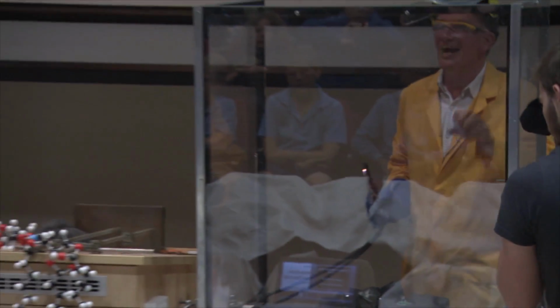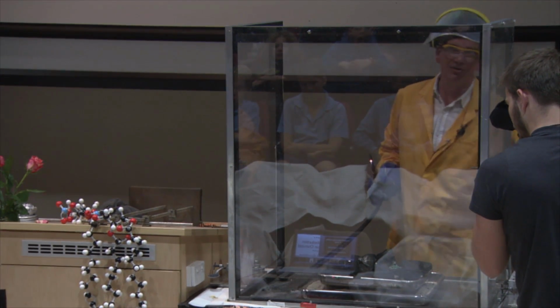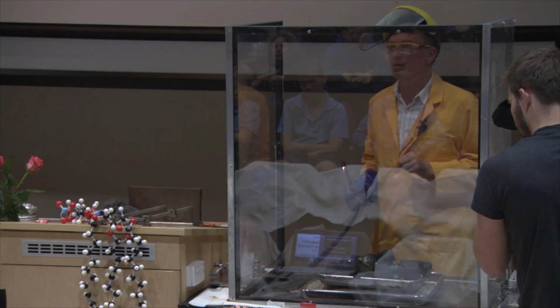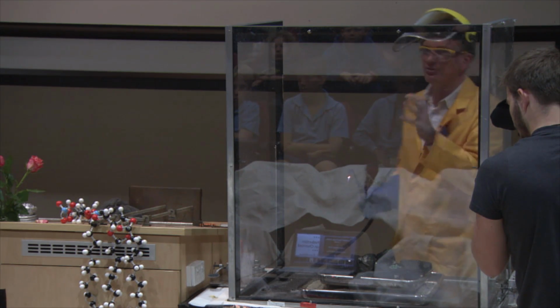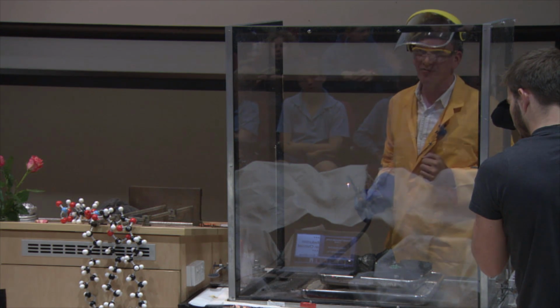Now I'm going to heat this up. Now remember, when we heat up the calcium carbonate, we drive out the carbon dioxide. And the same thing's going to happen with this carbonate. Heating it up will drive out the carbon dioxide, and that's going to leave, well, not calcium oxide, but copper oxide this time. And this is the chemical equation on here. So the copper carbonate, heating it up, driving out the carbon dioxide, and we're left with copper oxide.